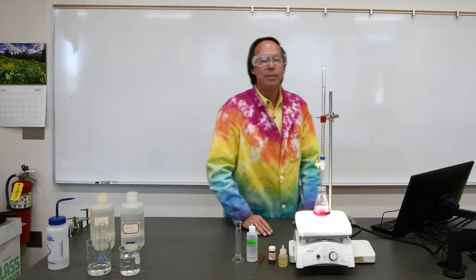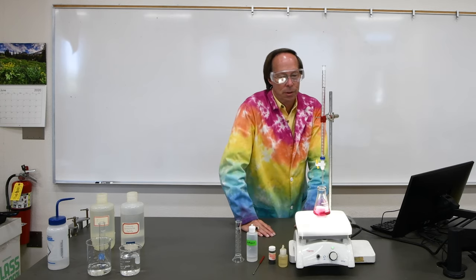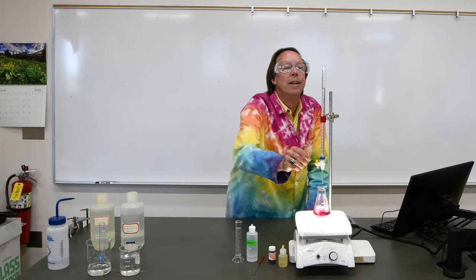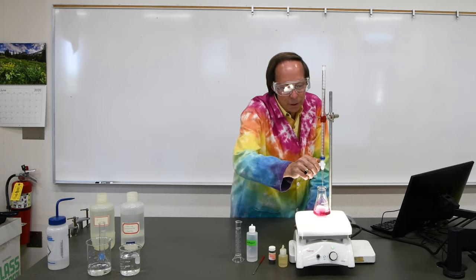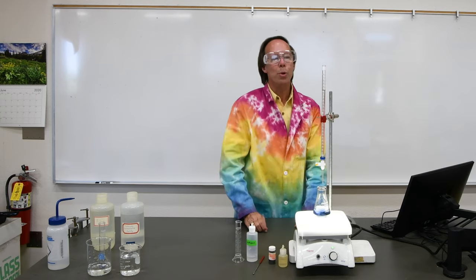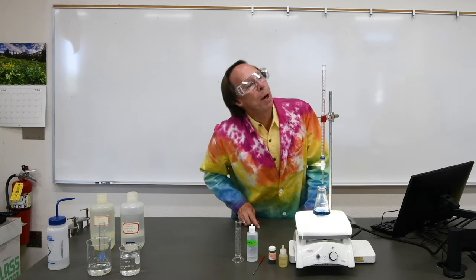Right, there's 0.5 milliliter. Should be somewhere around 1.5. There's 1 milliliter. Let's keep an eye on that color. Looks like it's just starting to change. It's purple and it's turned blue. So it looks like we have an endpoint again. And it looks like it took just about the same amount.